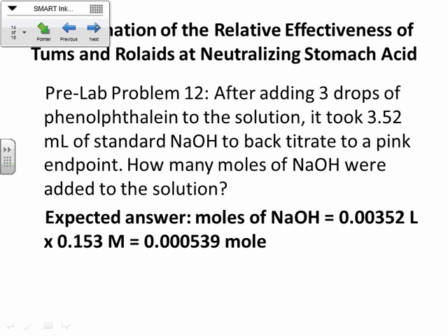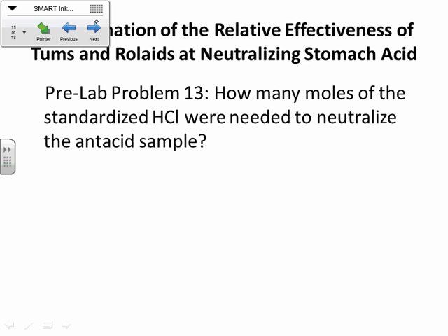And then we figured out that it took 0.000539 moles of the NaOH to back titrate it, okay? So that's going to tell us how much extra of the HCl that we had that we didn't necessarily need, okay?